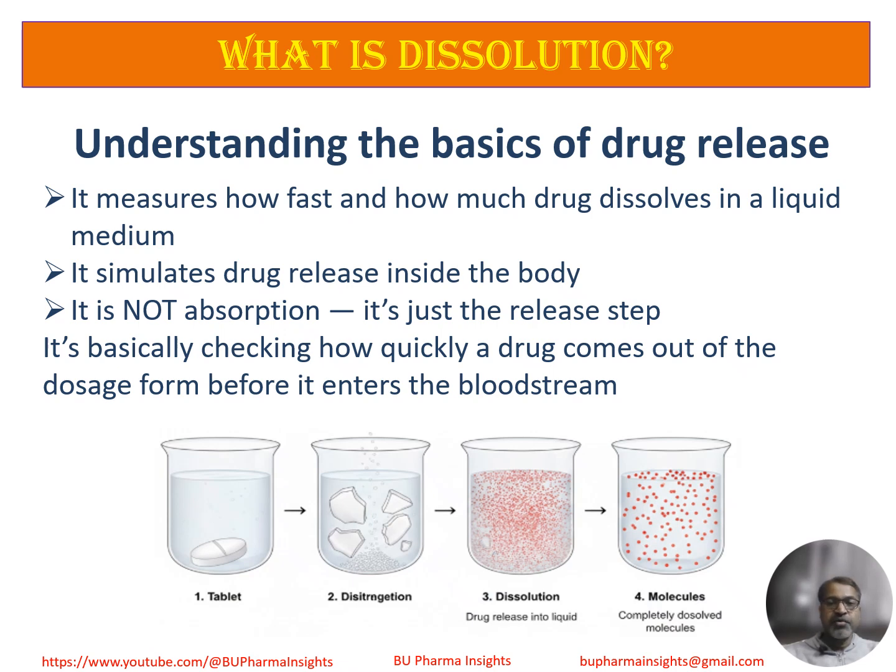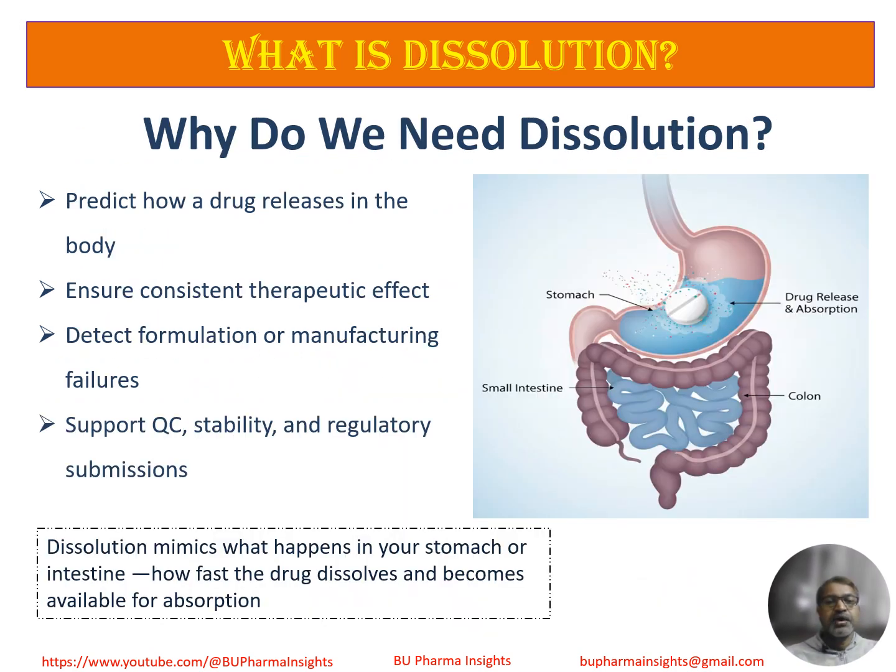Dissolution is only about drug release, not absorption. A drug must first dissolve before it can absorb. Absorption happens after dissolution, not during it. So, dissolution is essentially the step just before the drug enters the bloodstream. In simple words, we are checking how quickly and how completely a drug comes out of the tablet or capsule before the body can absorb it.